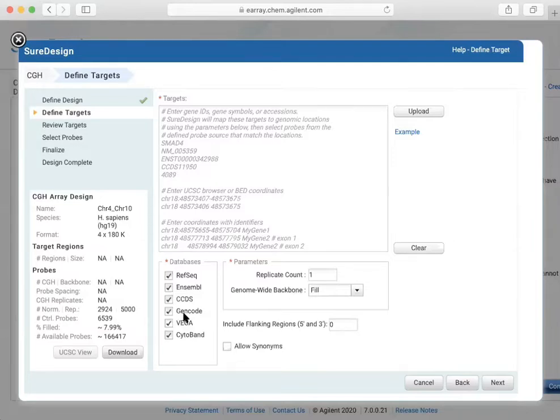Probes? Yep, go ahead. Like control probes. So you are looking at other chromosomes? Yeah, so it's basically probes that are totally unrelated to what we design. Okay, so they're just a control to compare. Yep, a comparison just to make sure the rest of the genome looks right. So all of this you would effectively leave the same.